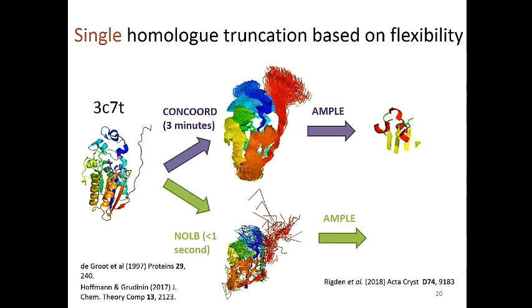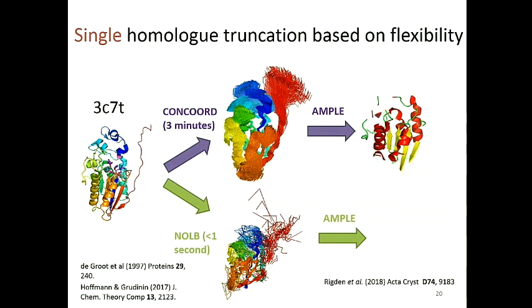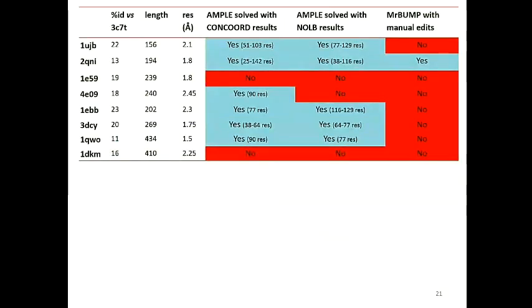What we're doing is taking the top 10 normal modes and positions along them, superimposing them. And again, this is a bit more messy, but again, the less well-packed regions come out diverse, and the well-packed catalytic site remains conserved. So we can truncate down those ensembles derived from a single structure and try and solve this set of targets, which are genuinely quite distantly related. You can see the percentage identity there. Particularly these two at the bottom are in a whole different area of the superfamily.